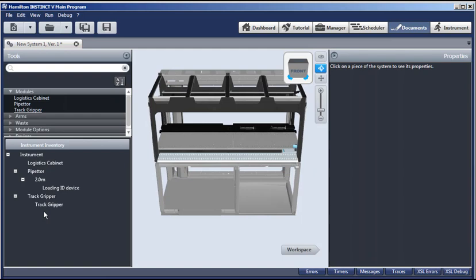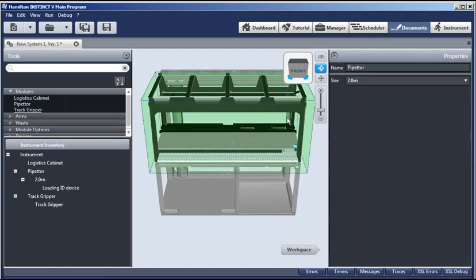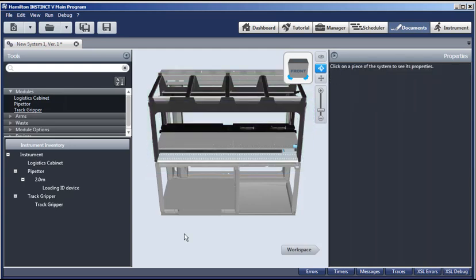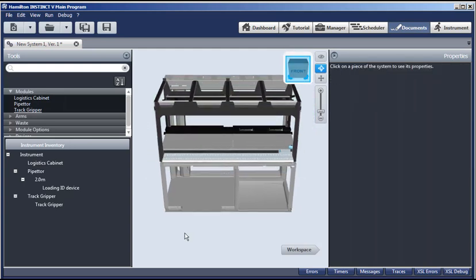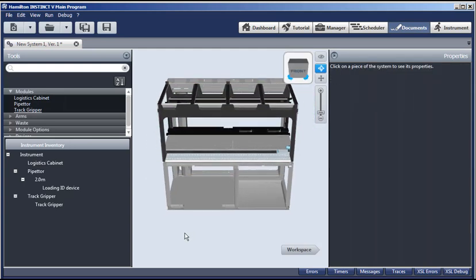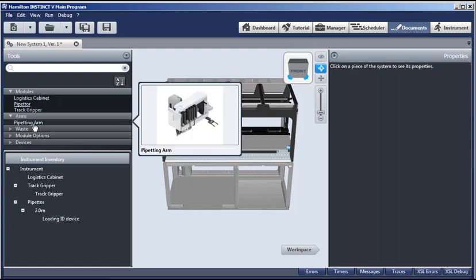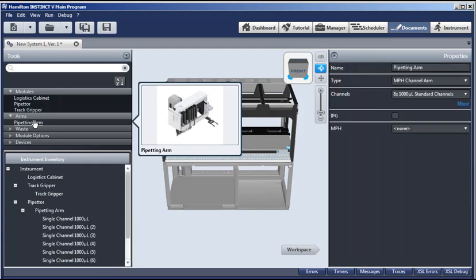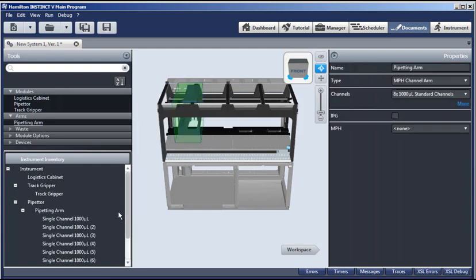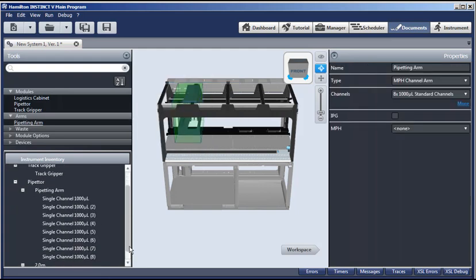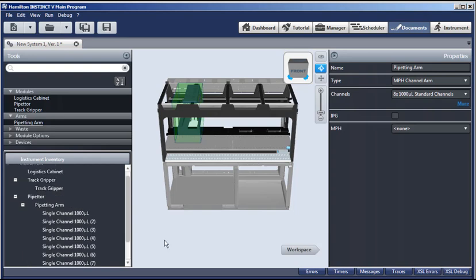In this case, we have a 2-meter size. And if you had a 1.3 meter, you simply select that size over here. And you can zoom in or out with the mouse wheel. You can also use any of these controls for zooming and panning. Let's continue now by adding our pipetting arm. So again, double-click. And we get a pipetting arm with eight channels that you can see here in the inventory.